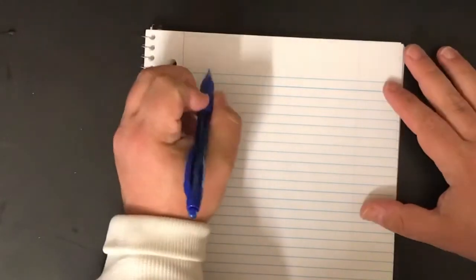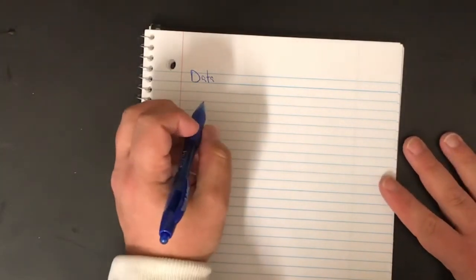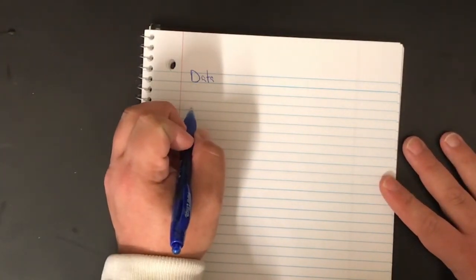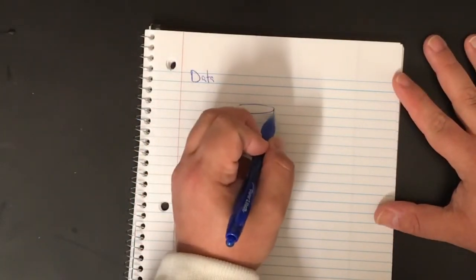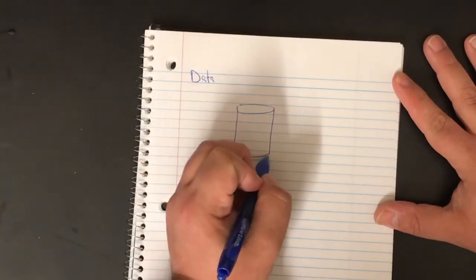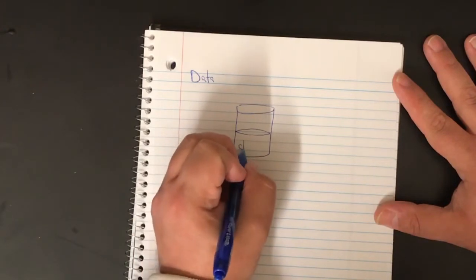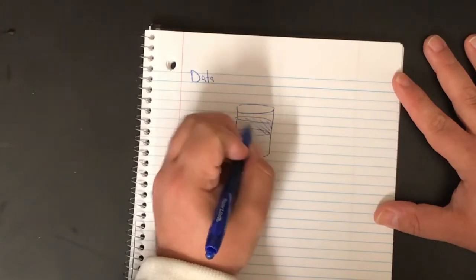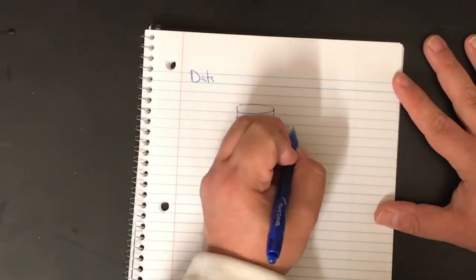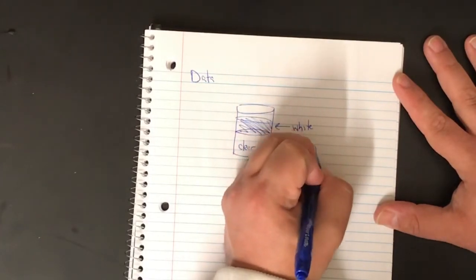All right, on to the data section. Now, for this lab, the data section is really weird, okay? Because you are going to be taking 2 substances and combining them, and you're going to have a beaker. And in that beaker, there will be a clear liquid at the bottom, and there will be a solid white substance at the top. That is your precipitate.